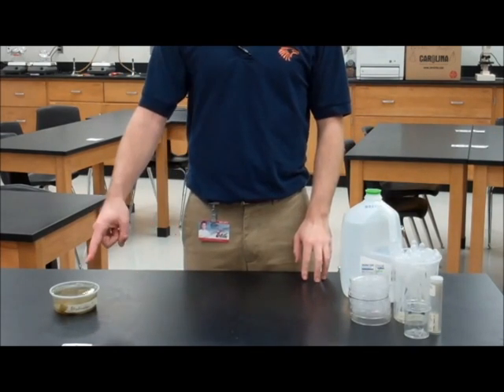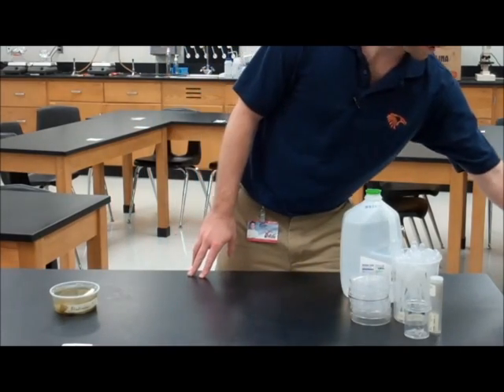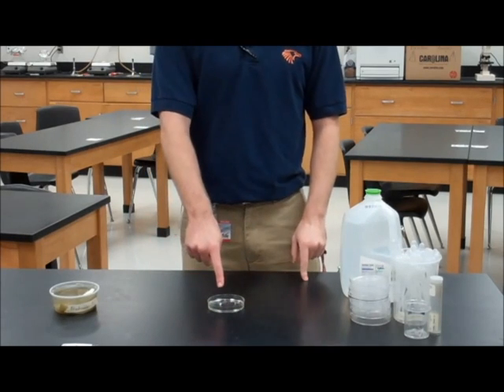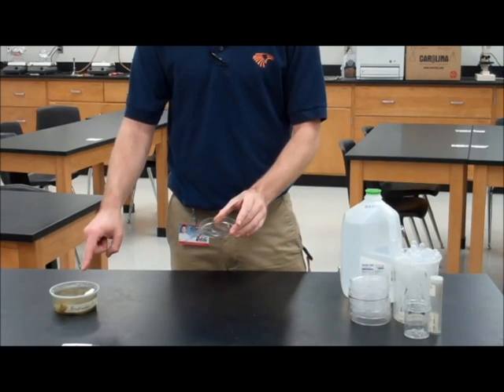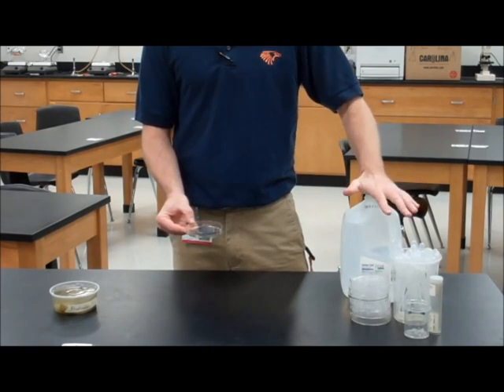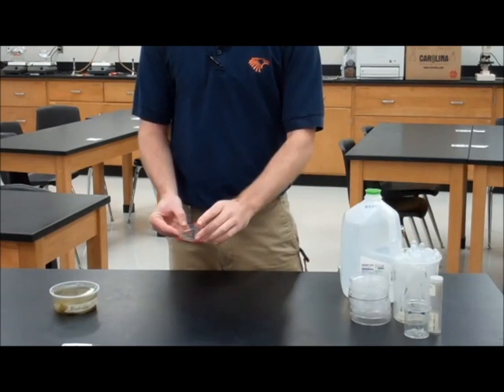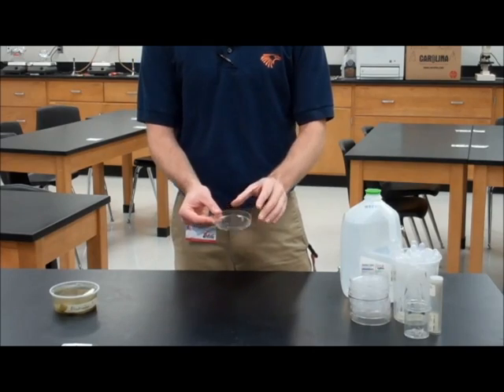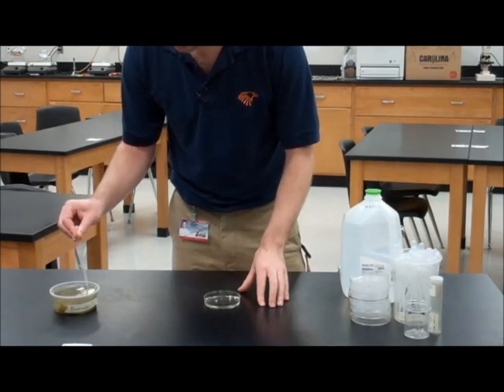The first thing we're going to need to do is get our black worms out of the culture and into a container from which we can work with them. I recommend getting a petri dish and filling it with some of the water from the black worm culture. Take care not to use DI or distilled water because you could end up bursting your black worms. Once you get a few milliliters of the solution into your petri dish, take your pipette and obtain a black worm.